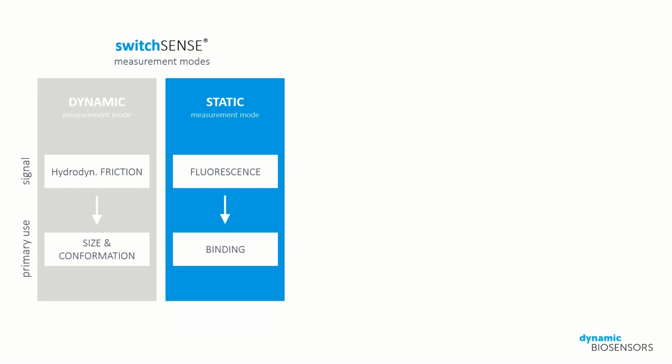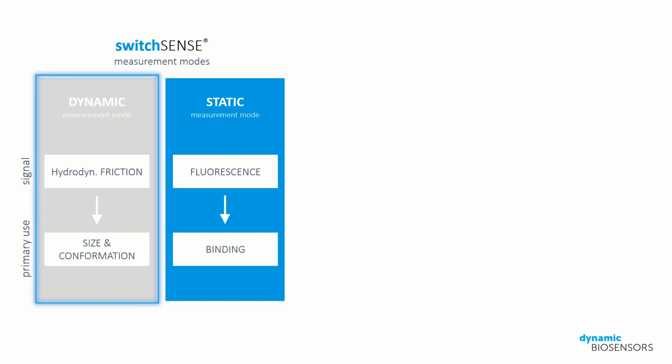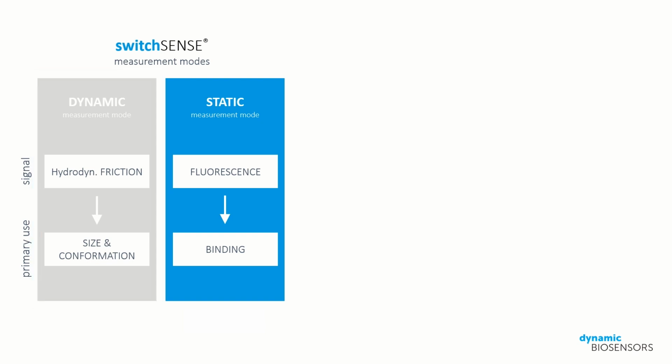The heliX features 2 measurement modes, static and dynamic. Static mode is primarily used for real-time binding measurements, while dynamic mode is used primarily to analyze ligand size and conformation by measuring their hydrodynamic friction. For measurement of T7 RNA polymerase binding to its DNA target, we chose static mode.